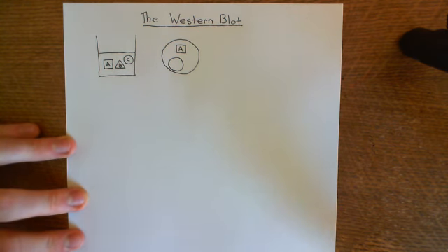So, we're going to start off by discussing the lysis of the cell to get the cytoplasm out, which has all of the proteins in, and produce our protein mixture, and then we'll discuss how the Western blot proceeds from there. Basically, what you will start off by doing is homogenizing your cell matter.